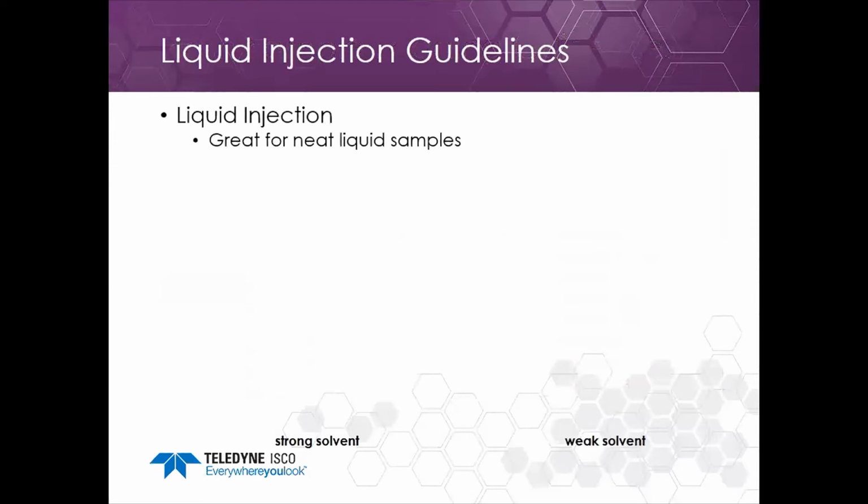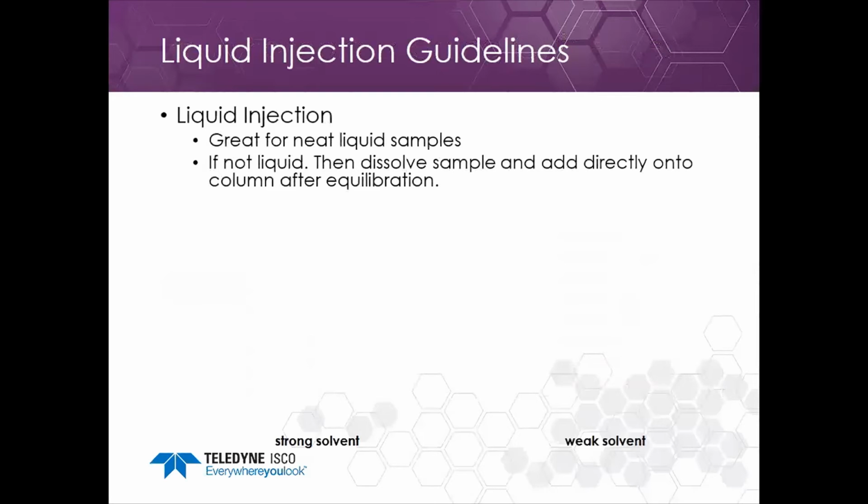And there's two different ways that you can load compounds onto the column or onto the flash system. One is you can do a liquid injection, and this is what you're originally taught in organic chemistry when you're doing your open columns, where you have a liquid sample and you're loading it onto the column, and some of the same basic rules are going to apply.